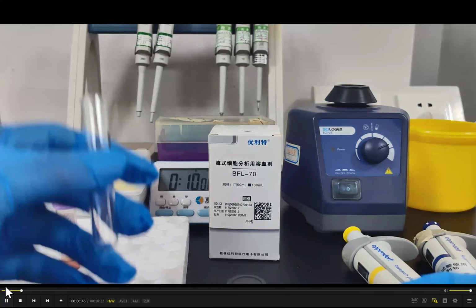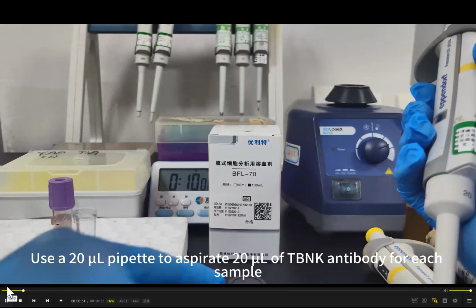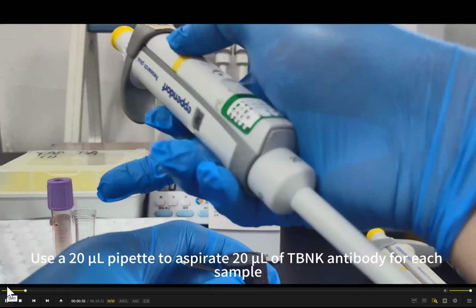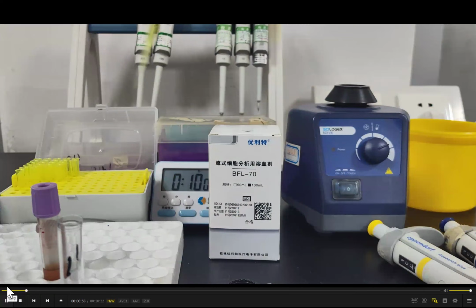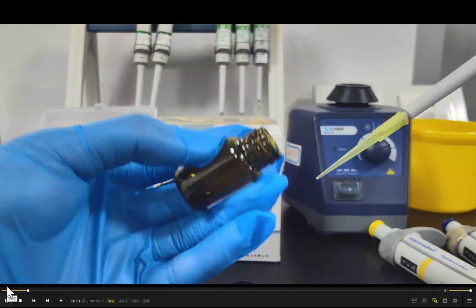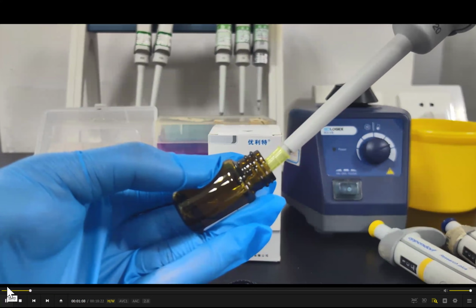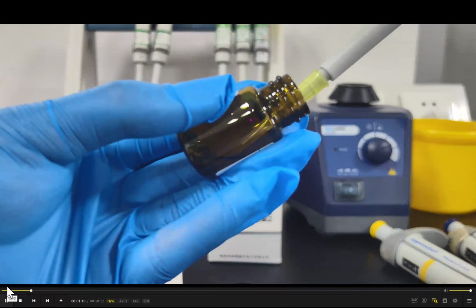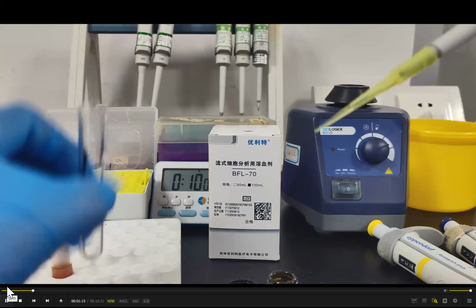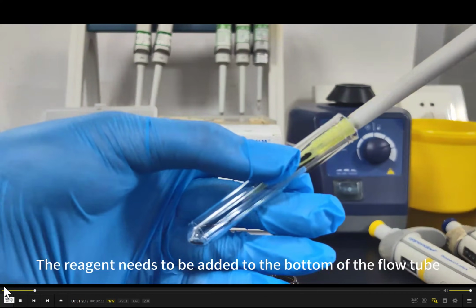Numbering the flow tubes. Use a 20 microliter pipette to aspirate 20 microliter of TBNK antibody for each sample. The reagent needs to be added to the bottom of the flow tube.